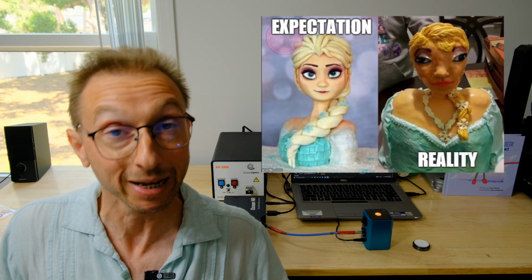And whether you're making a solar cell or shoes or a spaceship or whatever, you want to make sure you're making it right. And that's where spectroscopy comes in, because you can instantly, literally at the speed of light, check to make sure that everything is on track. And we've got this NIR set up behind me, and we're going to take a look at some of these cells in reflection mode using both a reflection probe and an integrating sphere.